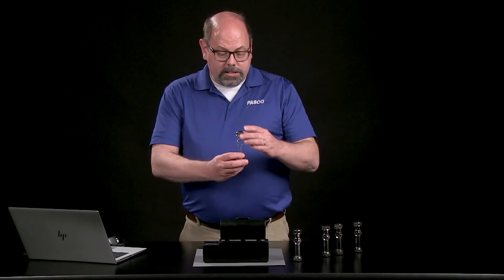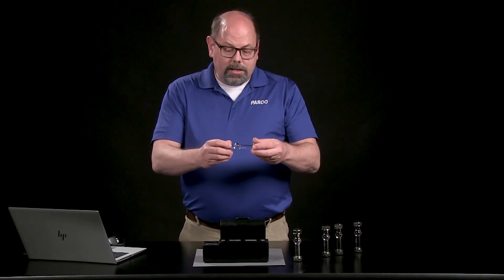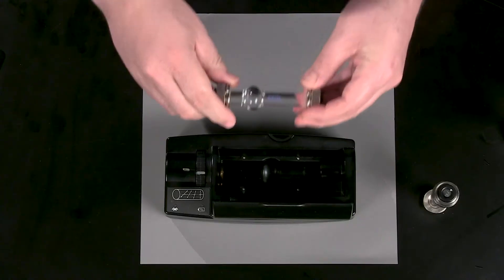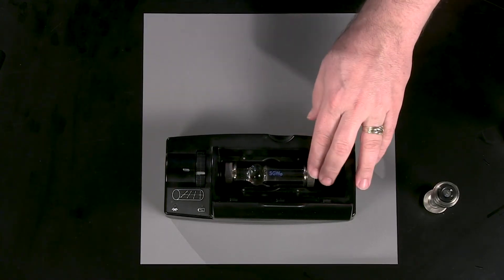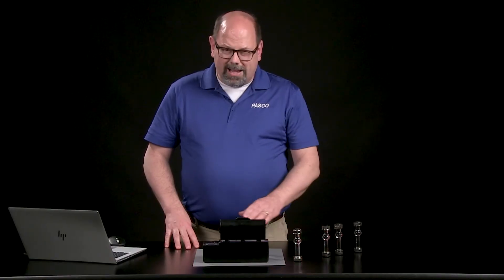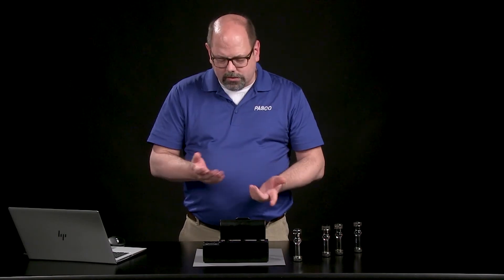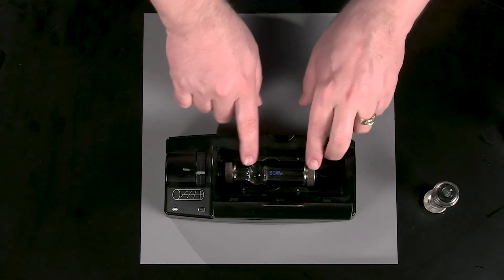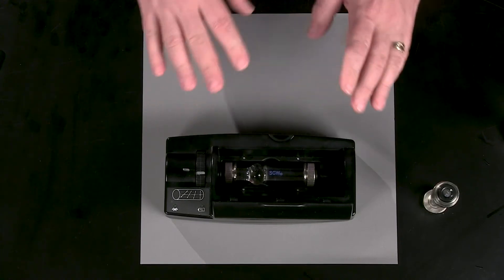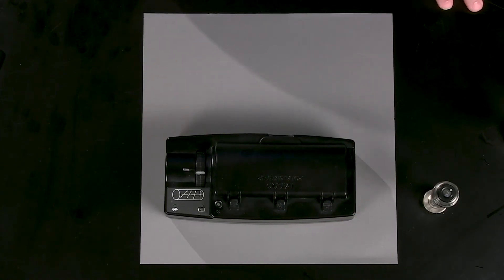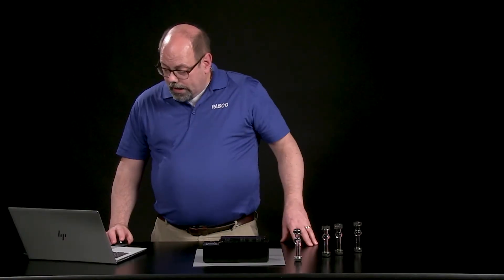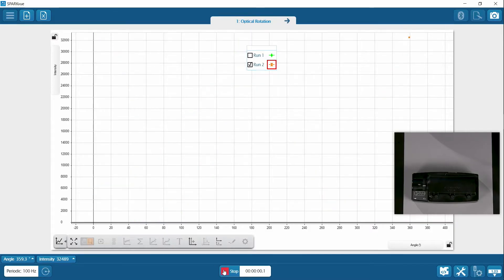Let's go on to a second run. We'll take our next solution, which is 3%. Again, we're going to orient the bulb so that it's one direction. We'll put the manufacturer's label on the top so we minimize the differences between these. Most of the labs are going to be written so you use one cell. You're using the same cell, keep it all oriented. Move that cell one direction so it fits the same way it always is. Make sure your wheel is in about the right place, a little ahead of where you started. And let's run the second solution of 3% sucrose.